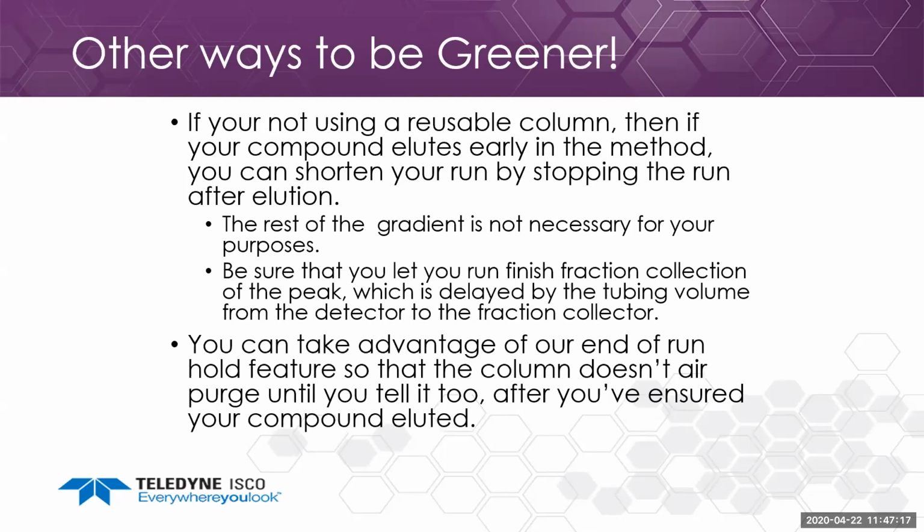You could also take advantage of our end of run hold feature on the NextGen. Basically, that allows your run to stop. The column won't do the air purge until you tell it to do so after you've ensured that your compound's eluted off the column. So it'll pause the run and wait for you to say, okay, my compound's off, and then it'll go ahead and air purge the column and do all the wash steps and things like that for the valves.